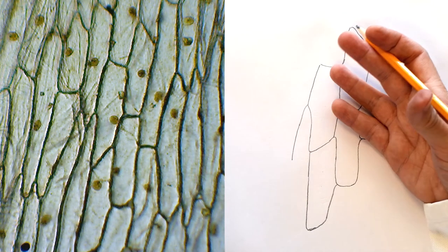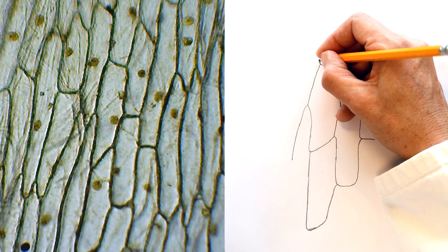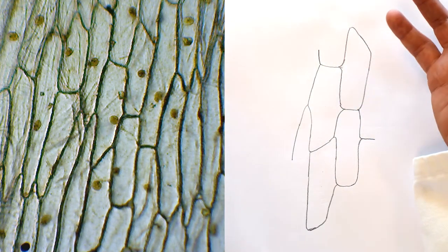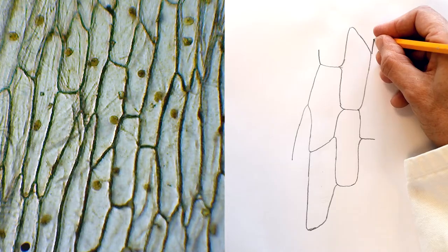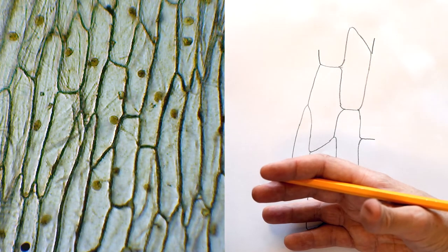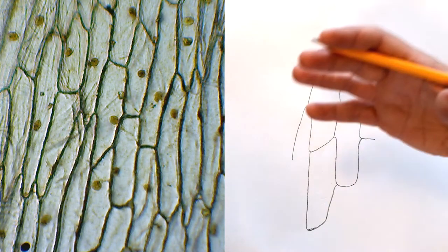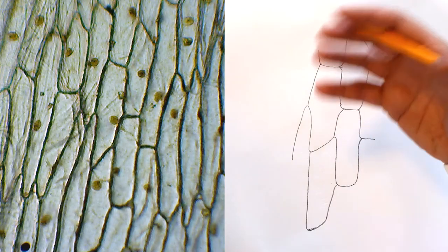I recommend you draw between four and five cells no more and that you draw the neighbouring cells in sufficient detail to show how each cell is interacting with its neighbour but you don't need to draw any more than that. Notice the size. I've taken up more than half the sheet of paper just with those four cells. Now what else can I see? What other detail can I see down here?